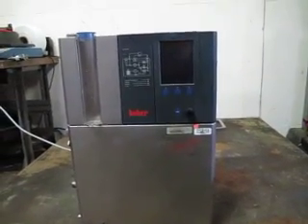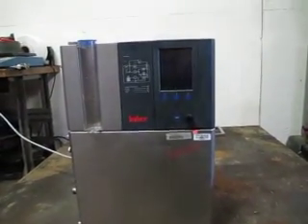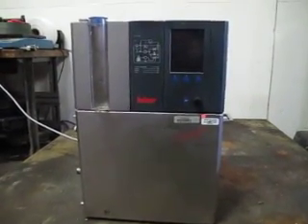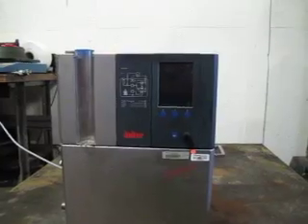You're bidding on a Huber Tango Nueve chiller. This came out of the closed lab of a pharmaceutical company.